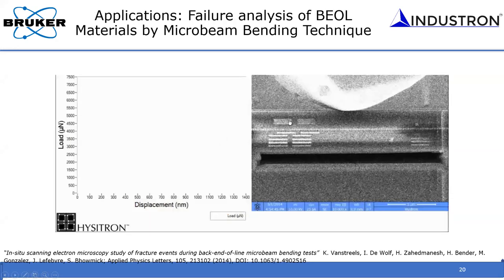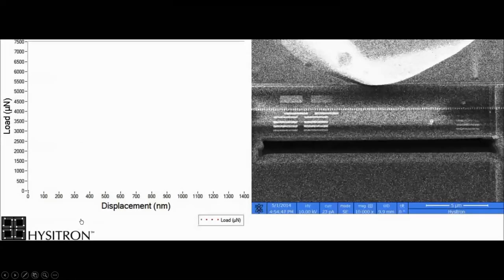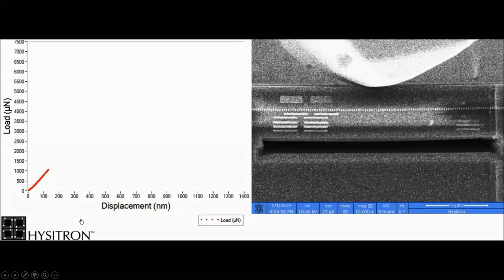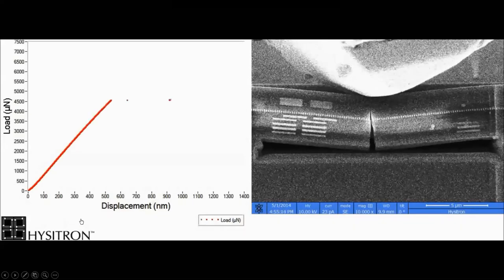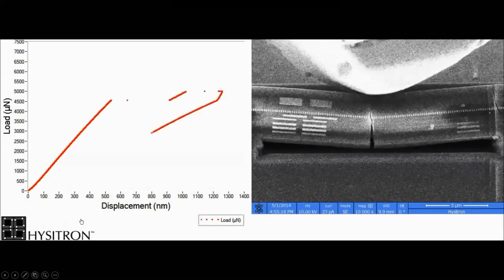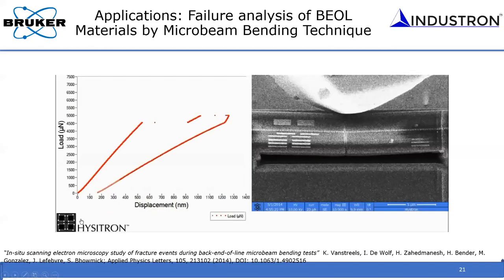Now let's look at this particular video, where you see that it's the same structure, but with a different kind of landscape. And now you see that this fracture is totally different. The fracture that happened before was conical type. Here it's a straight vertical type, but you have the same load displacement response, but the way that it fractured is different. That information you only get from the video. If you just look at only the load displacement curve response, you won't have that information.